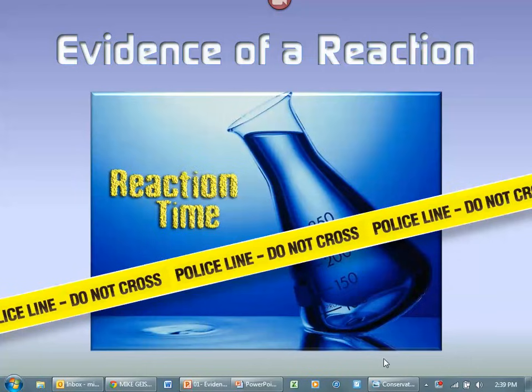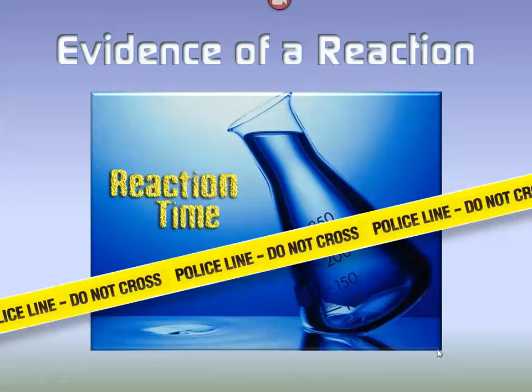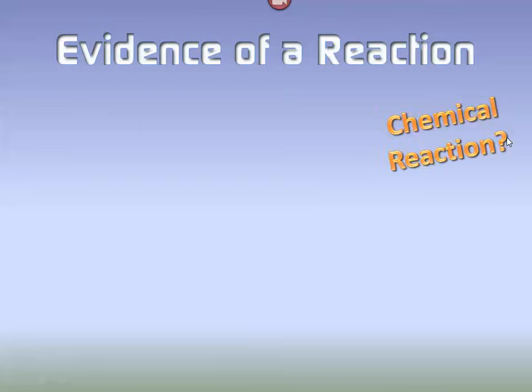All right, it's reaction time. We're going to be looking for evidence of chemical reactions. So here we go. Let's do this. Question: is it a chemical reaction?